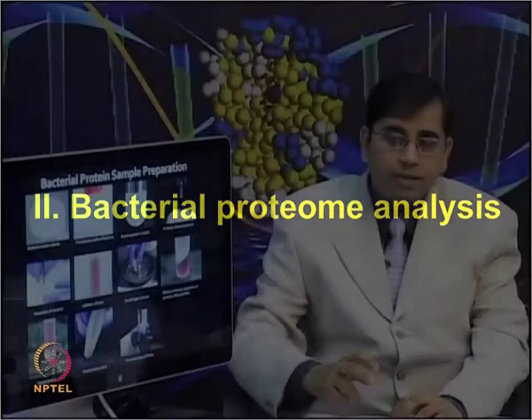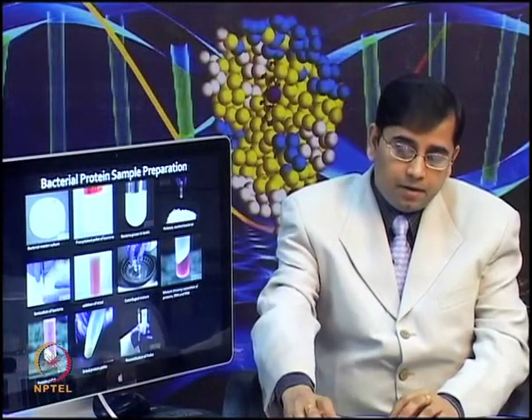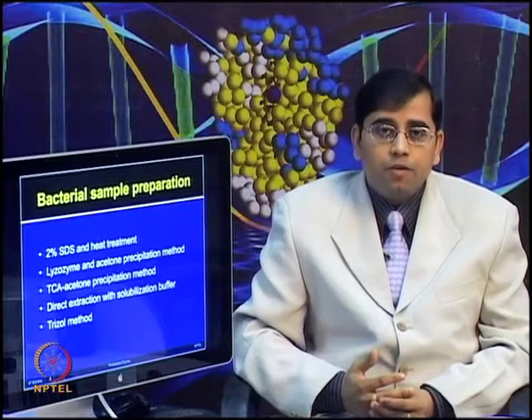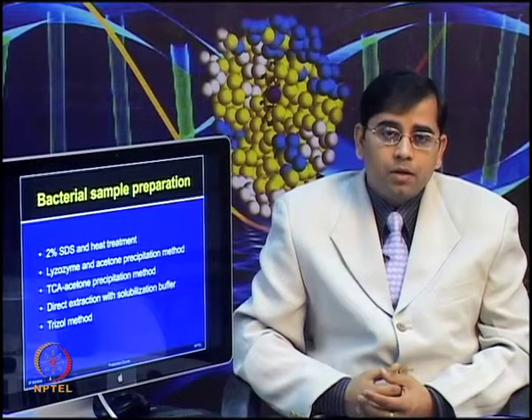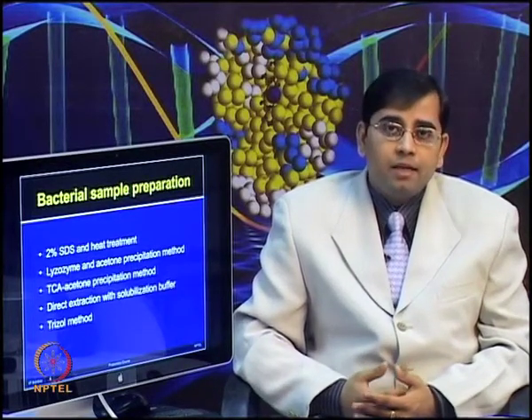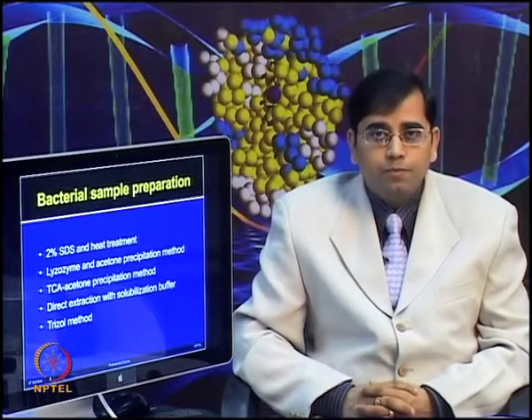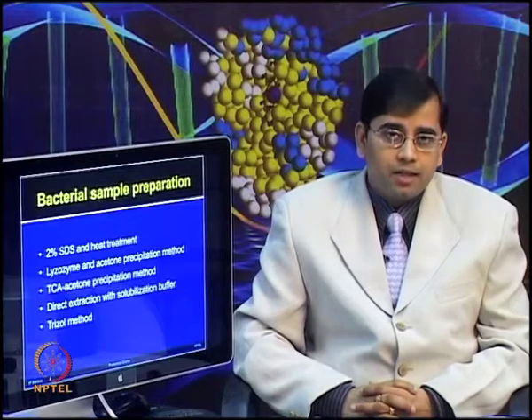If you remember, in the last lecture I stopped on the slide where I showed you various steps which are involved in bacterial protein sample preparation. Now let us elaborate on this and continue with different sample preparation strategies which people apply for bacterial protein extraction. These are all reported methods available in the literature. I have just compiled them for your brief overview. For the detailed protocol of each, you can refer to the detailed publications.